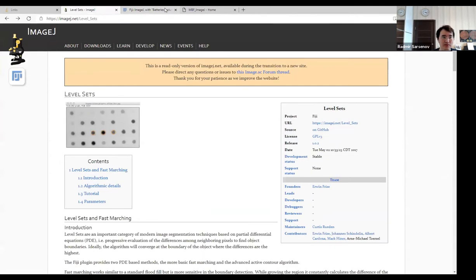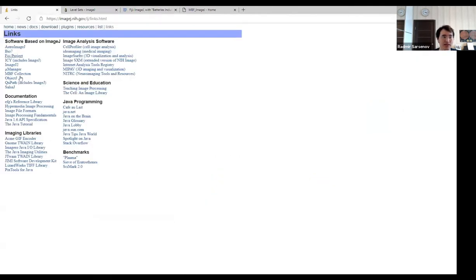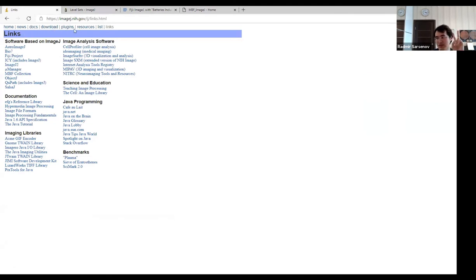If we take the MBF collection, you can go to the McMaster biophotonics facility. From their site, you can obtain the whole information on the documentation. You just type MBF ImageJ and it directly gets you to the site called imagej.net/MBF. From here you can find all the manuals, all the functions, the documentation about the plugins that are used with this MBF collection.